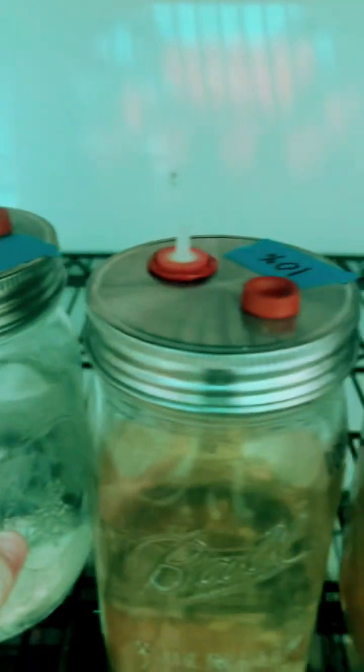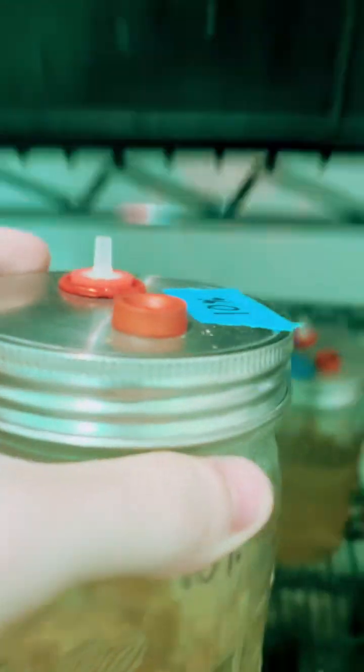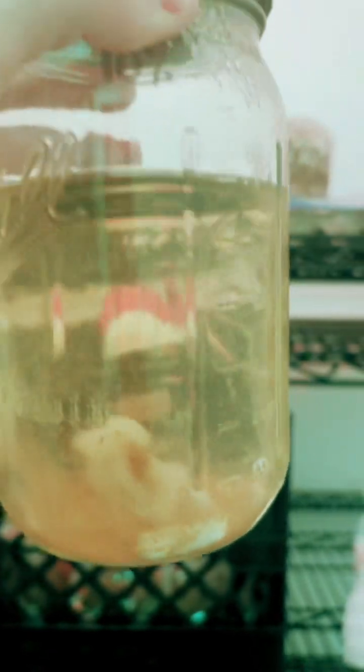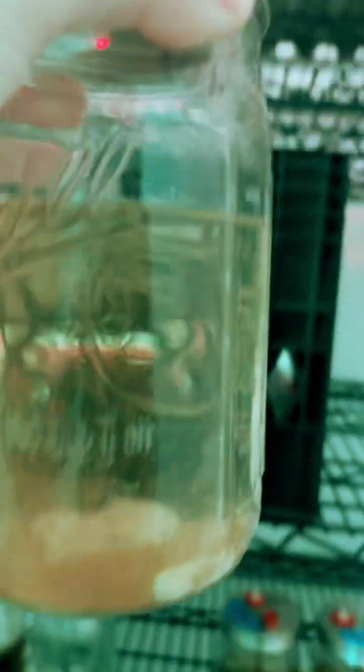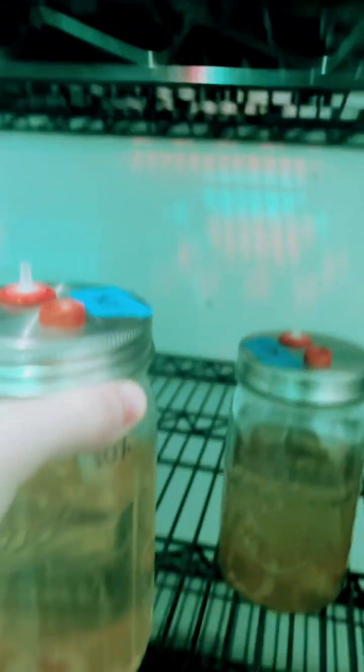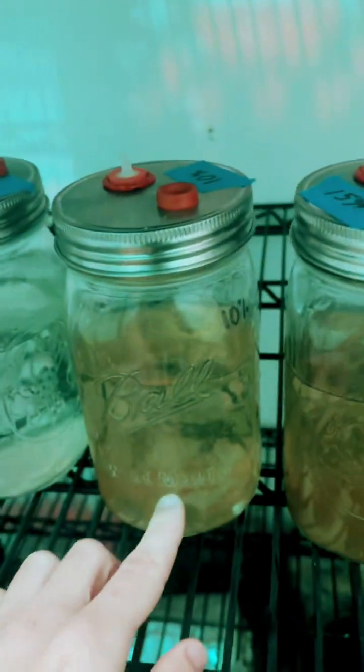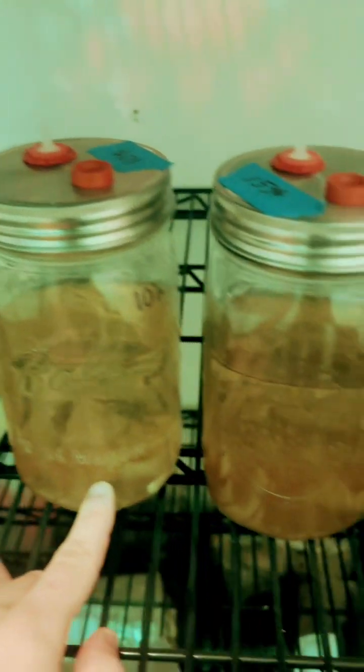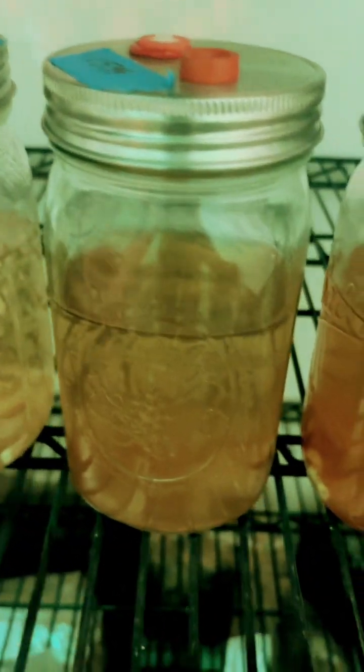So you have 2%, 2%, this is 10% right here. 10% grew a little, grew a bit smaller. It grew a lot more compact. So I'm wondering if this is maybe the threshold of when we're adding too much of that rye liquid or too much sugar.